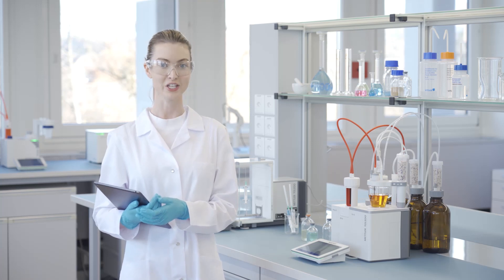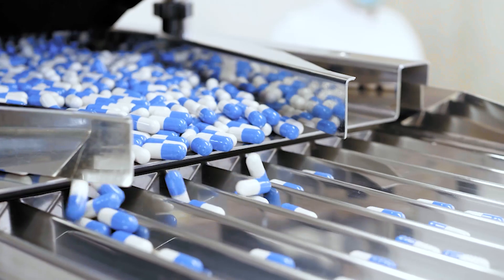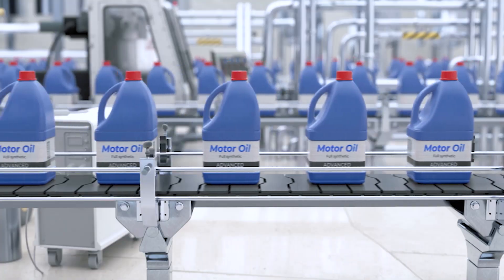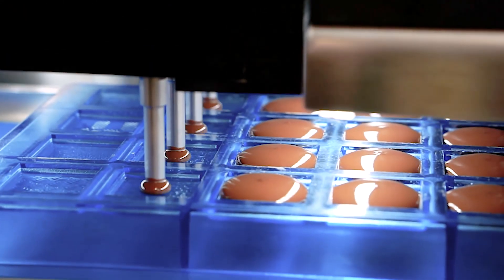Keep up with the digital revolution with LabX and the EVA titrator. The METTLER TOLEDO EVA Volumetric Karl Fischer Titrator helps boost your business productivity and gain efficiency. Speed meets reliability.